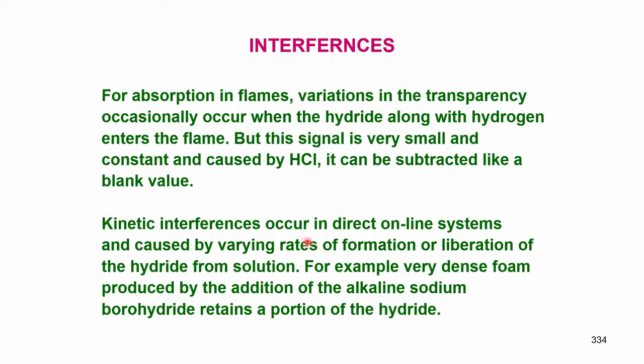Okay. We have discussed interferences. The interferences mostly arise from kinetic problems, that is, carrying out the reaction and taking it into the flame.